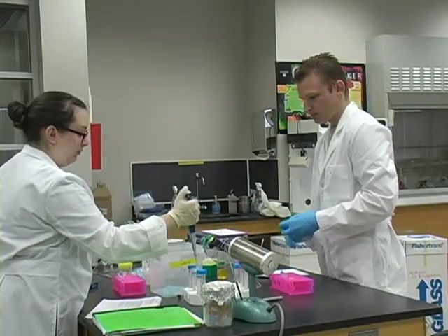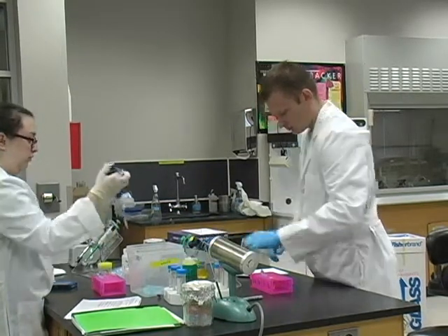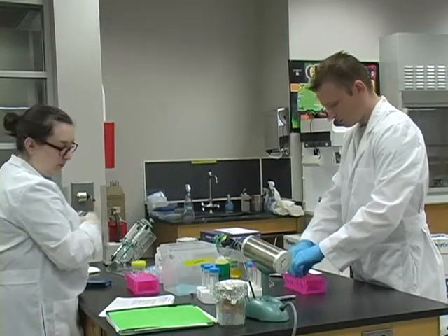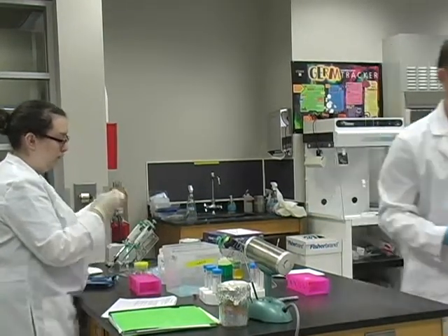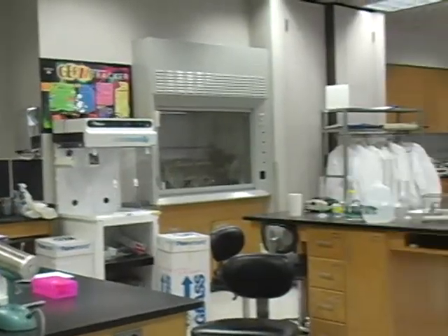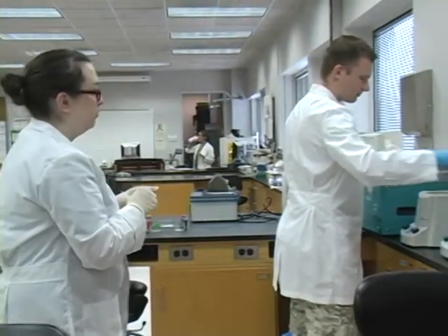The plasmid DNA will bind to the silica, and then they're going to remove the plasmid DNA from the silica. Once it's eluted, it'll be in a very small volume — maybe like 50 microliters — and they're going to take a small volume out of the 50 microliters and run it on an agarose gel.